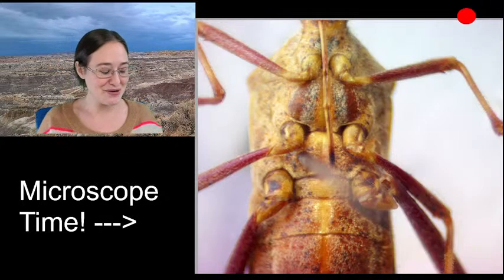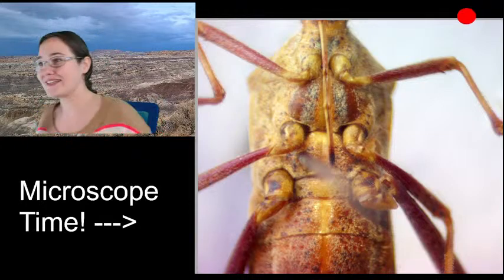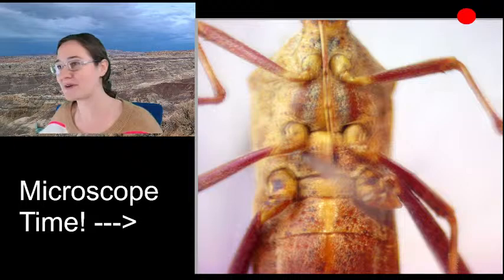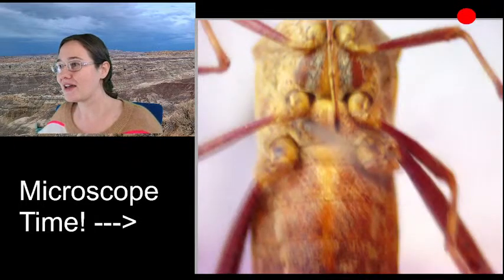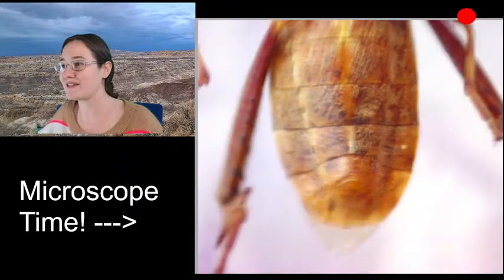I saw so many cool things and I want to sketch them. Let's check out his abdomen really quick, because we might be able to guess if it's male or female. Let's check it out.